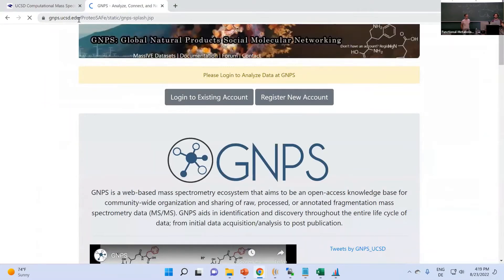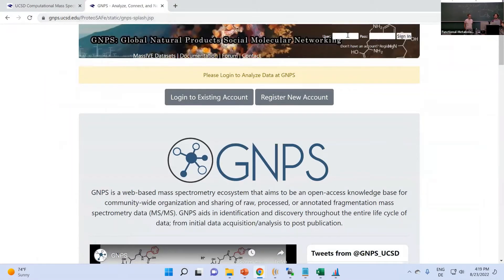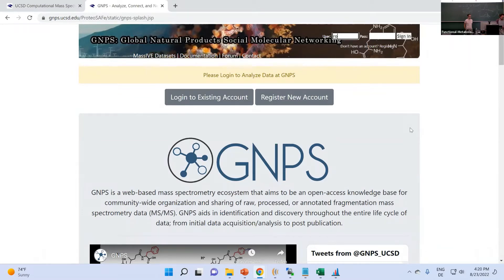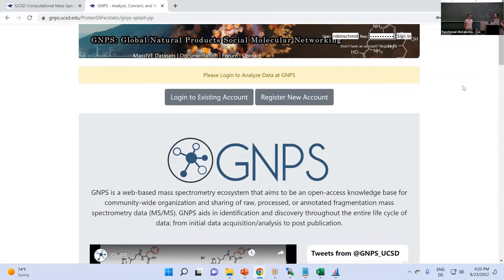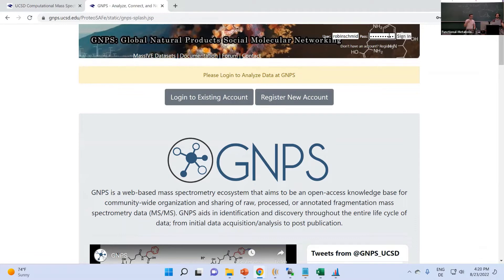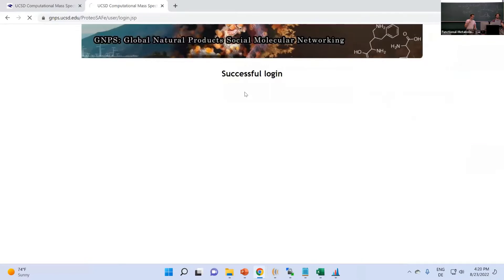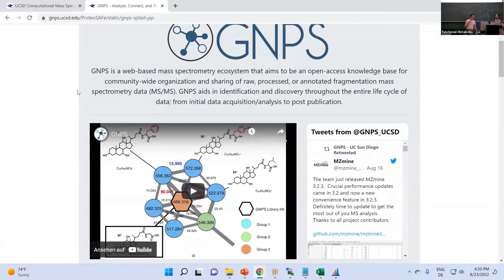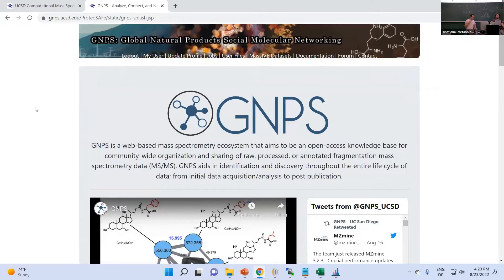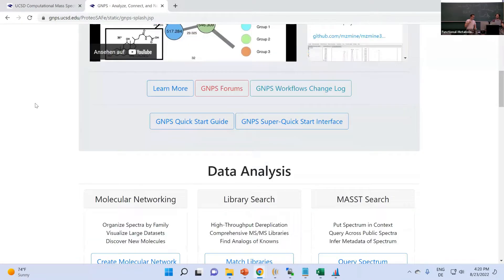Go to gnps.ucsd.edu and here you can already log in with your account. In the top right corner you can type in your MassIVE and GNPS user credentials and sign in.